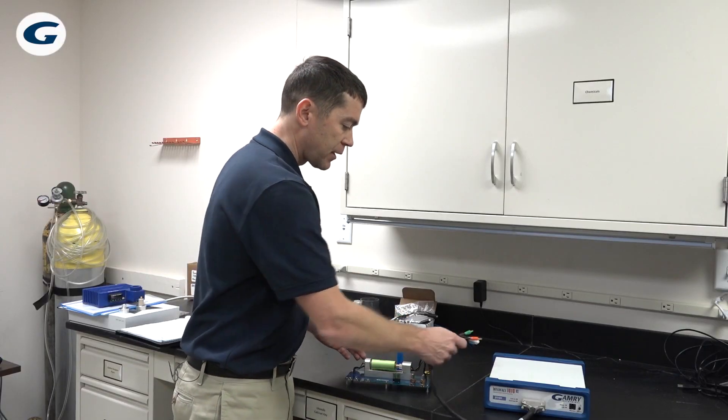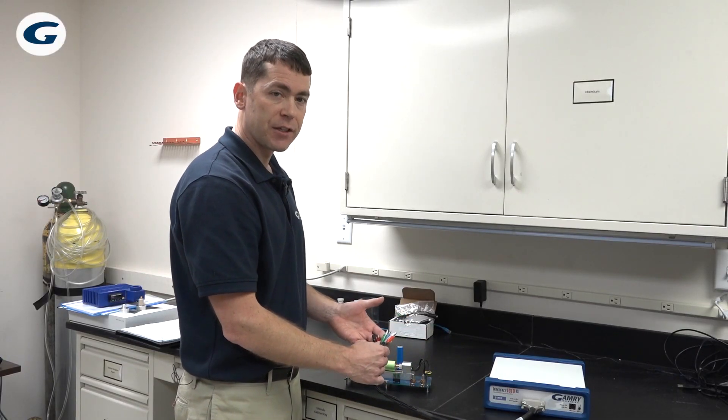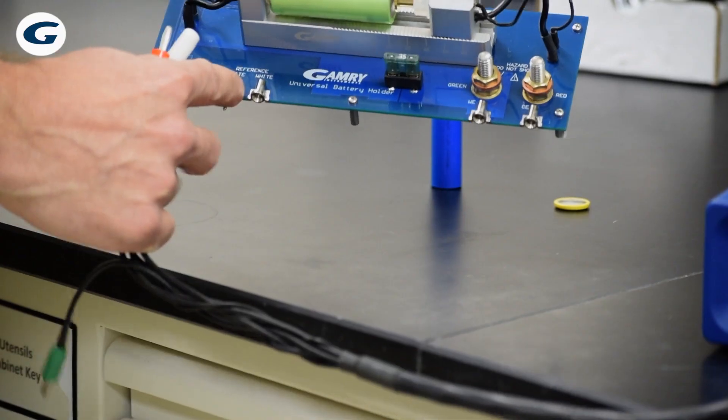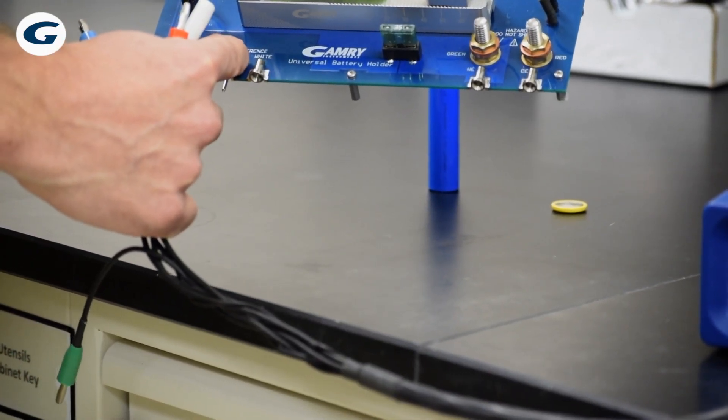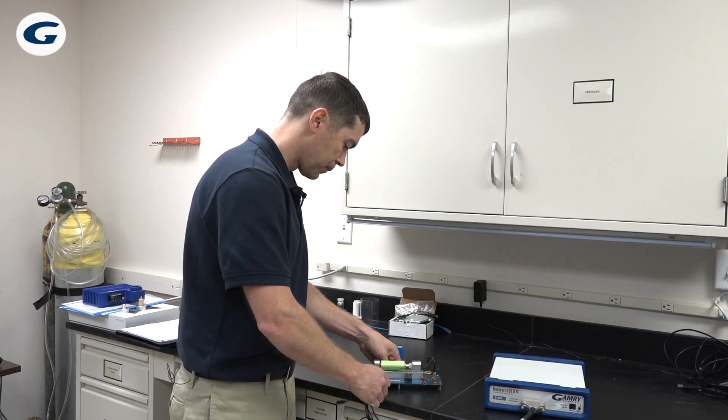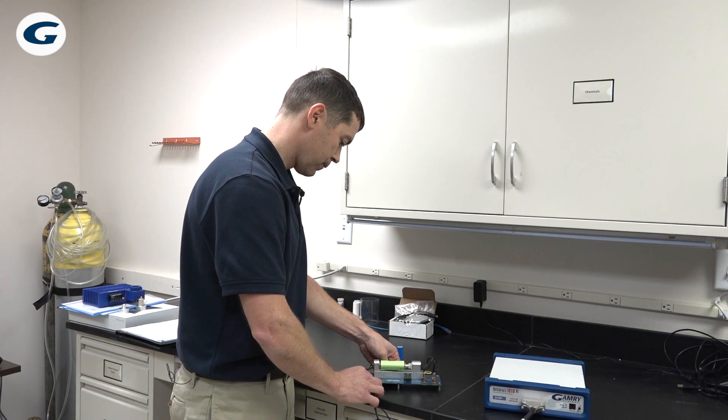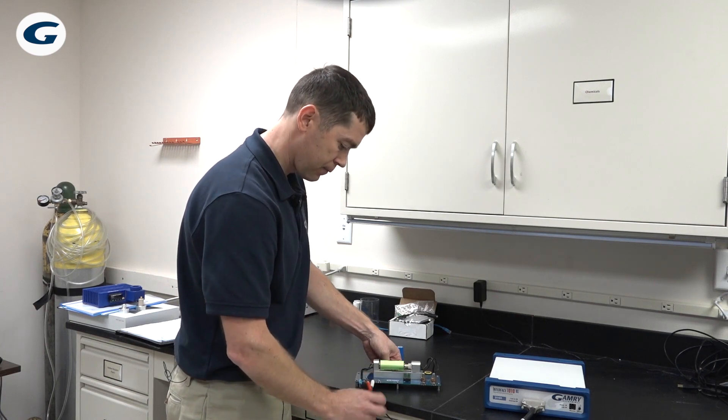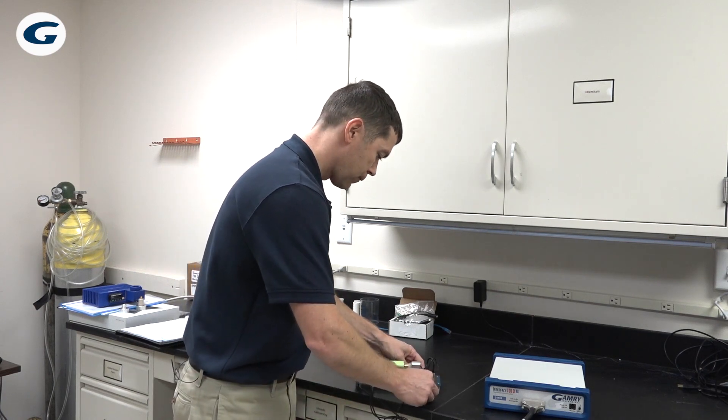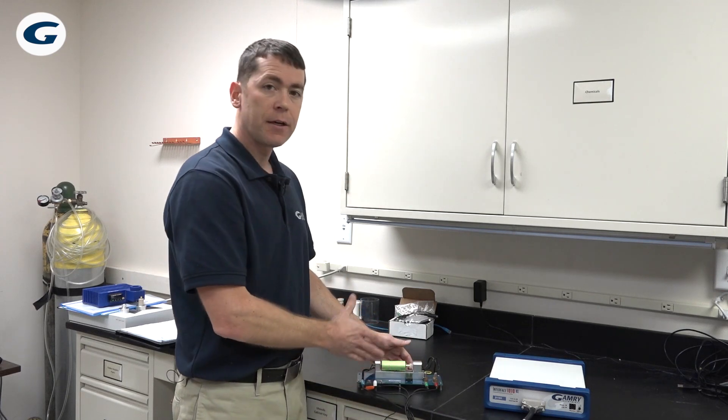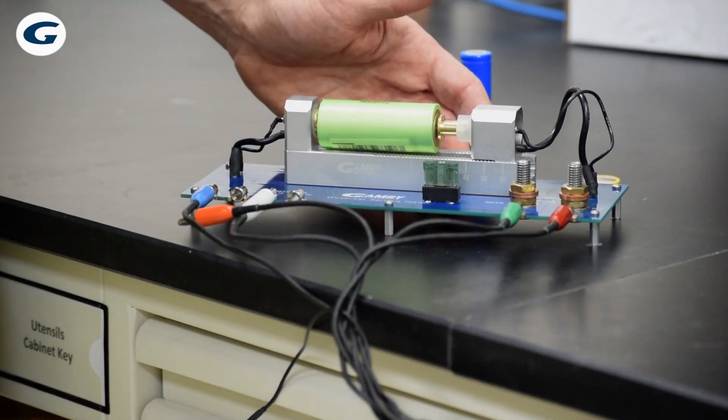Then we take the cable from a potentiostat and we make connections to the Universal Battery Holder. All the connections are labeled for you so it's really easy to do. Now we've made our connections and we can run all the experiments that we want to.